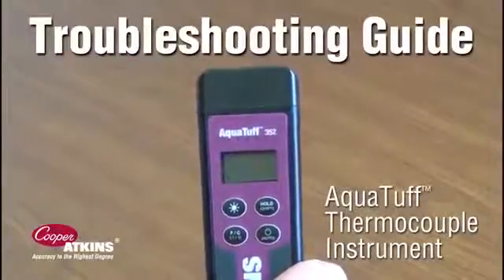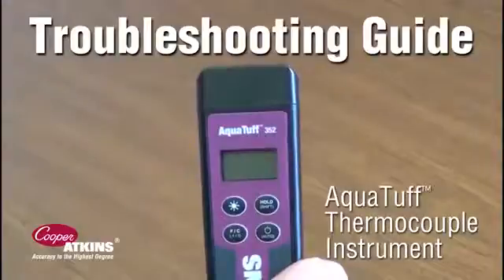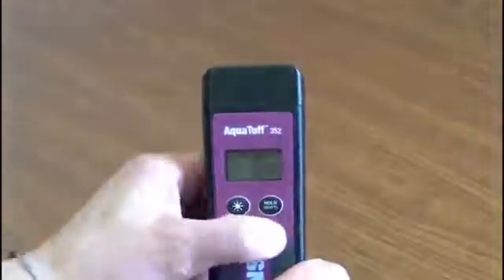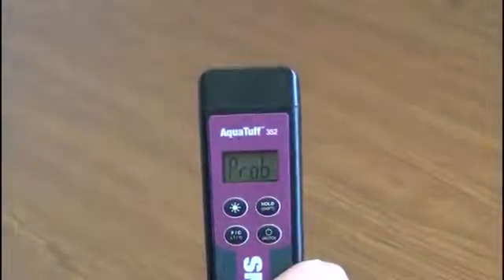To check if your AquaTuff thermocouple instrument is working properly, follow these simple instructions. First, turn the instrument on by pressing the power button. On will appear on the screen, quickly followed by PROB.